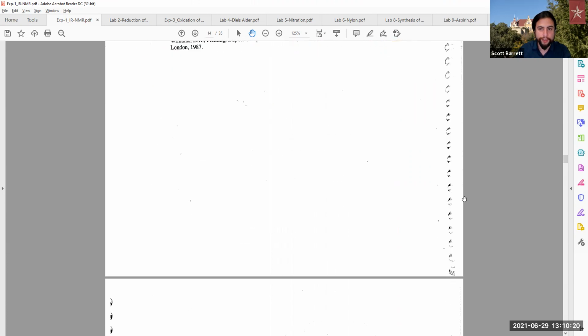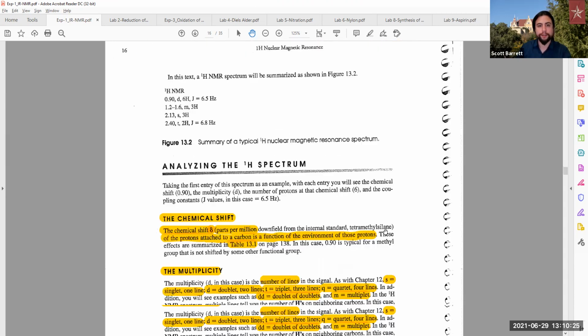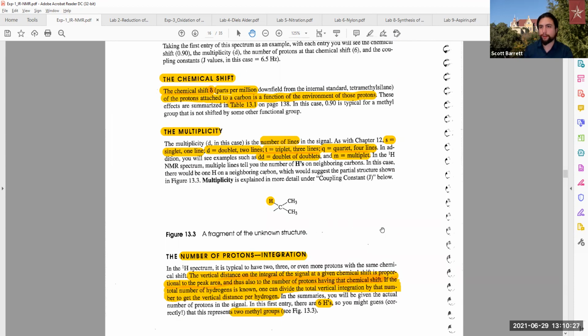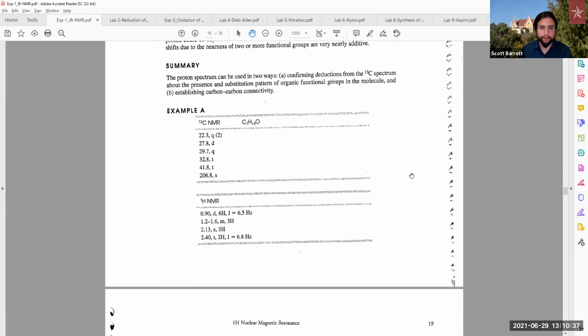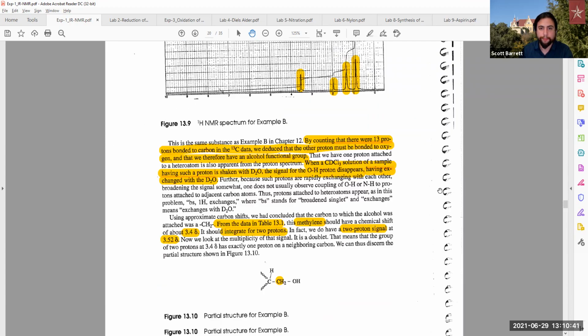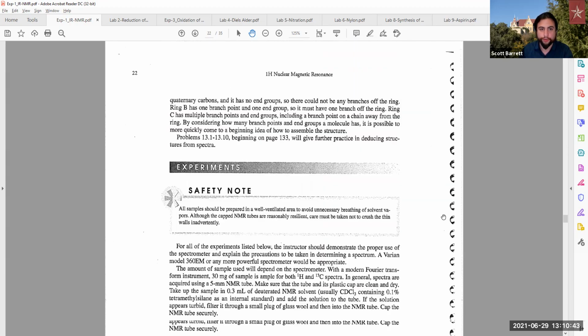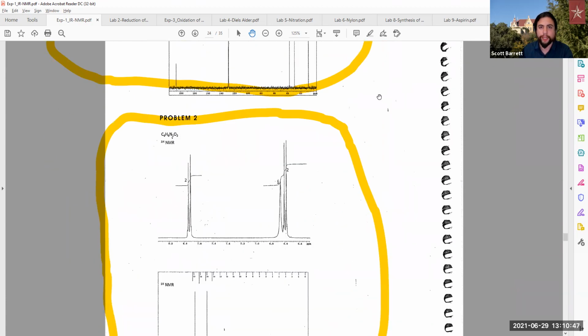And then additionally, now we're going to go over into the NMR. So the NMR background information, I'll let you review in that video because I saw that everyone in the class had already watched that video. So the primary thing that I really wanted to discuss with NMR was the location of most of the functional groups. And so I'm going to pause this for one moment and open up a separate sheet.